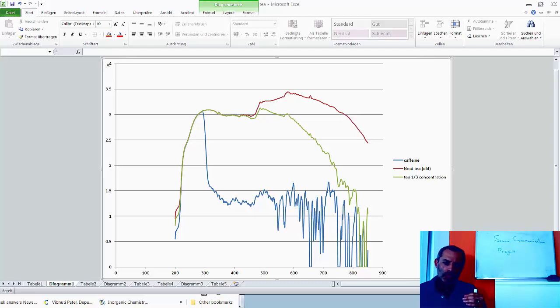But we can see here there's a very big absorbance. It seems to be cut off and distorted. That's why it's looking weird. So we have to do something about that.